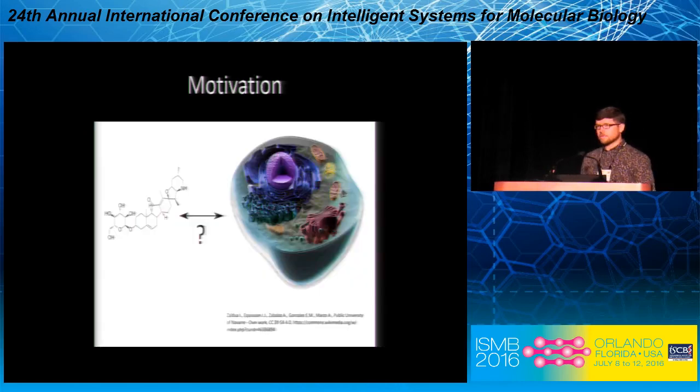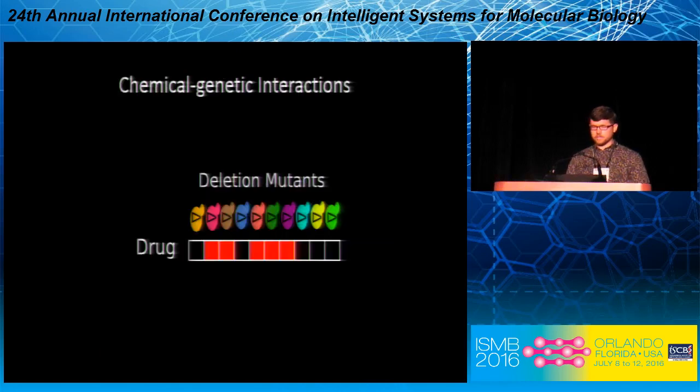The basic motivation for designing the software comes from these chemical genomic screens that our collaborators have performed, and we've been primarily involved with the analysis of the data. The questions that we are asking are very basic. Basically, they're what happens when chemicals interact with biological systems. People have been asking these questions for a long time. We have a complementary experimental approach to ask these questions and get at new, potentially insightful answers. And the system that we use involves the yeast genome deletion collection.